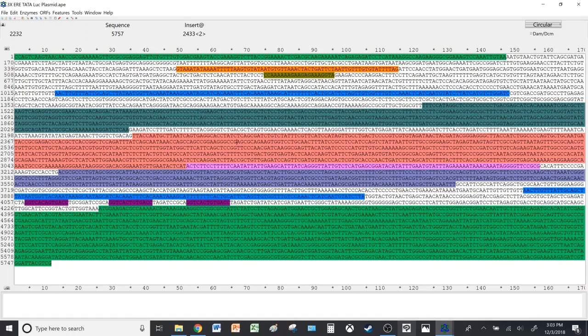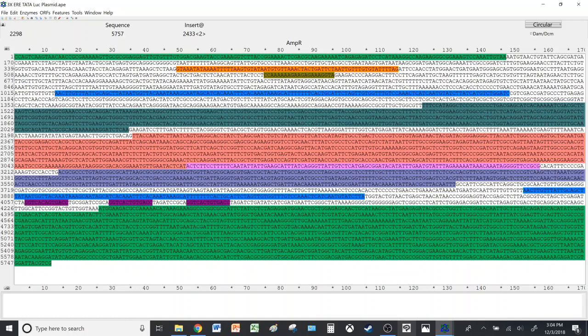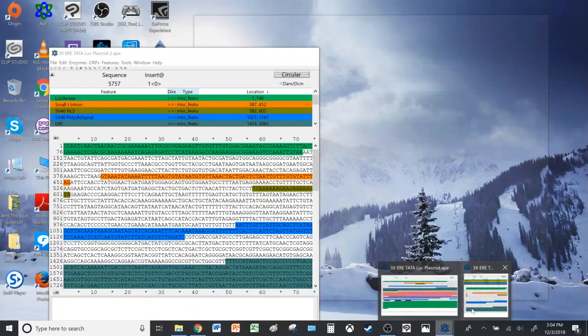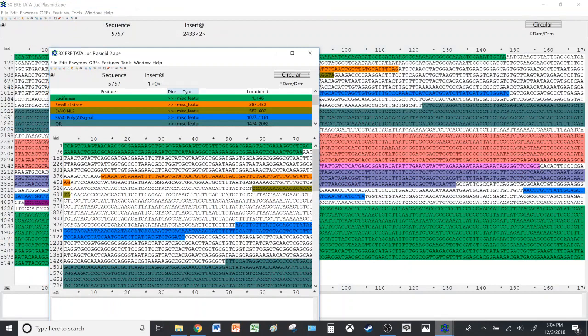And then the sequencing results were compared with the estimated modification performed on ApE. So my professor suggested a program called Clustal XL, but I discovered that this program also performs alignment as well.